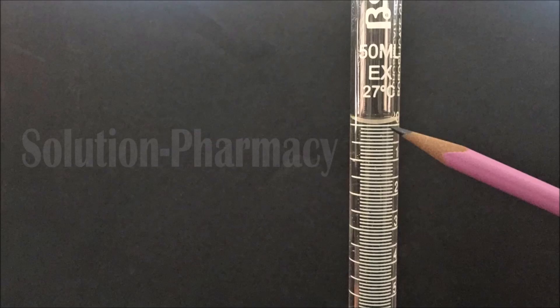Hello friends, welcome to the channel Solution. Today in this video we will tell you how to take accurate reading of upper and lower meniscus of any liquid inside the buret. First of all, here we have filled colorless liquid — here it is water — inside the buret.